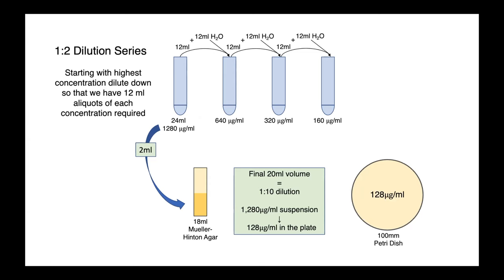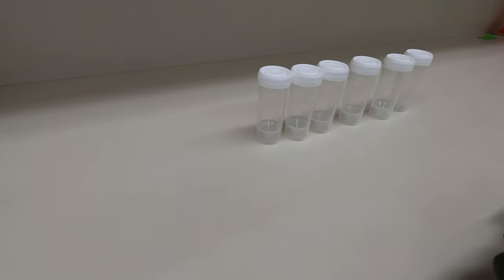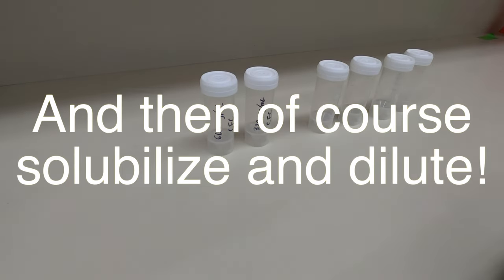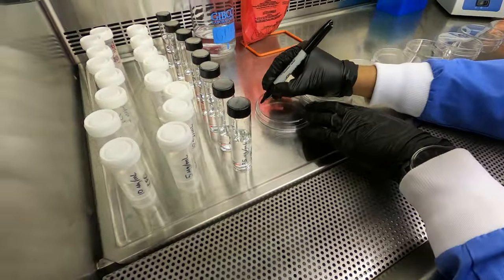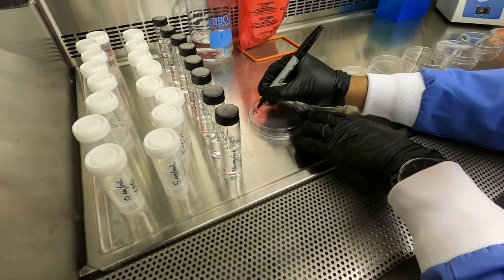Let's see how all of these steps look in the real world. Once we have our antibiotic powder weighed out, the next step is to label tubes to make our drug dilutions. Now we're ready to move to the biosafety cabinet to pour our plates.